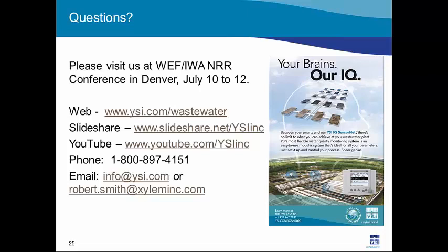Actually, for the nitrate sensors, we have really only one flow cell type. I don't have the specific details there, but if you contact YSI, we can set you up with the flow cell equipment you'll need.